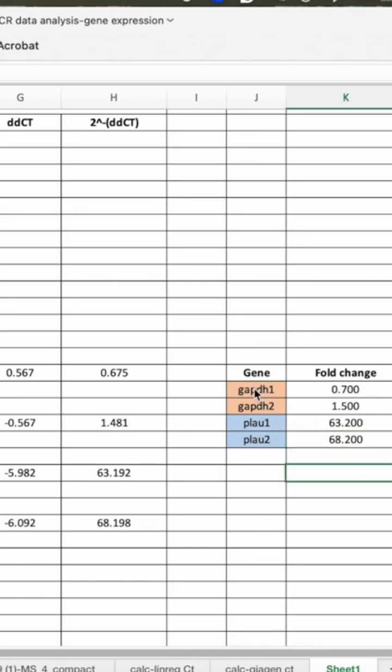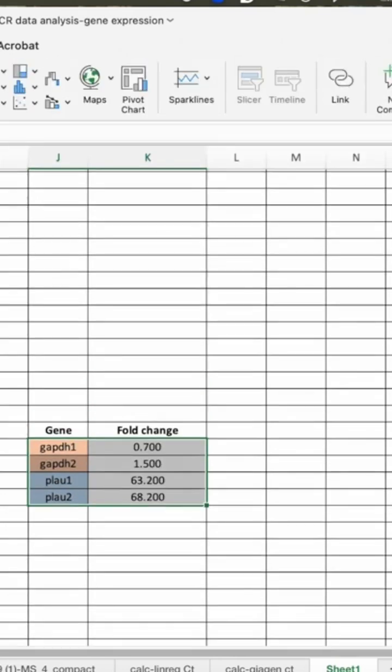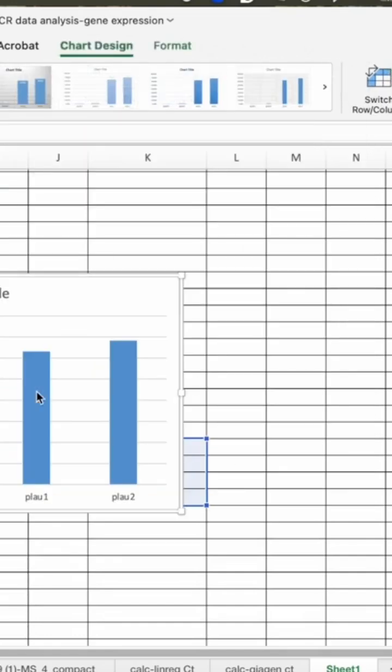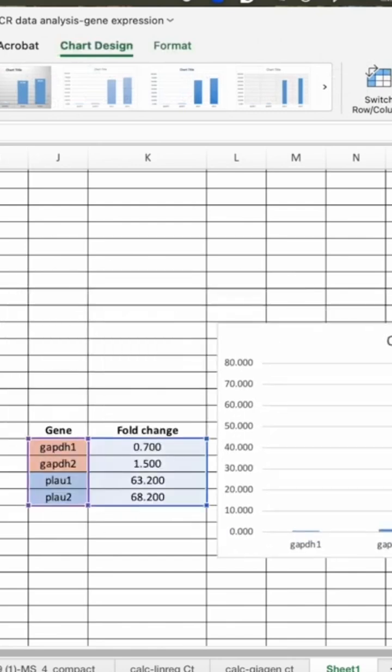So now we'll be plotting here. We can insert a graph here. I guess this graph is okay.